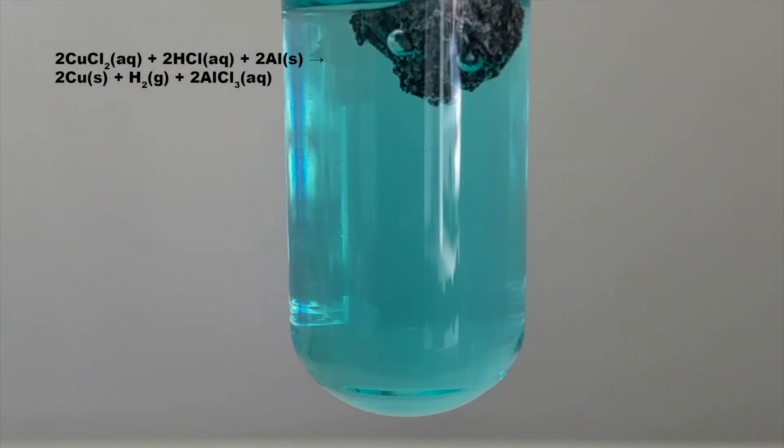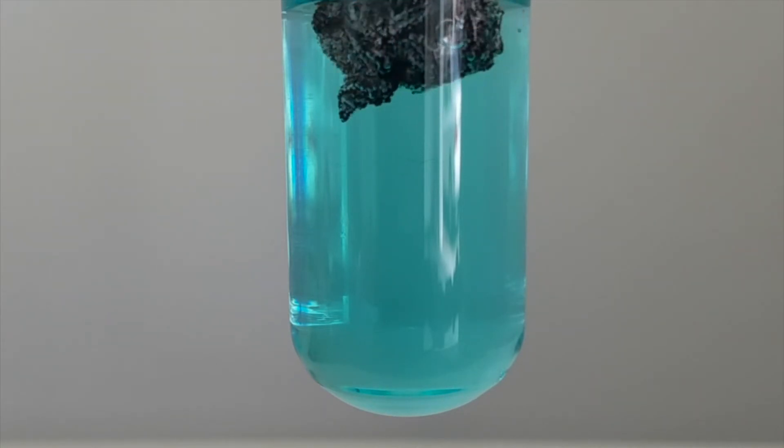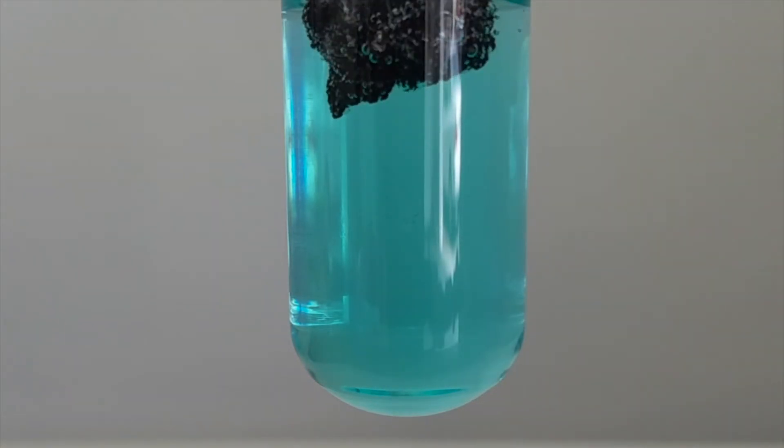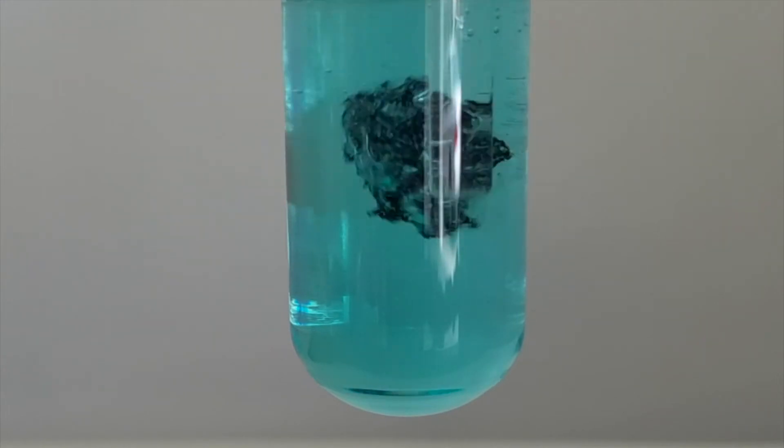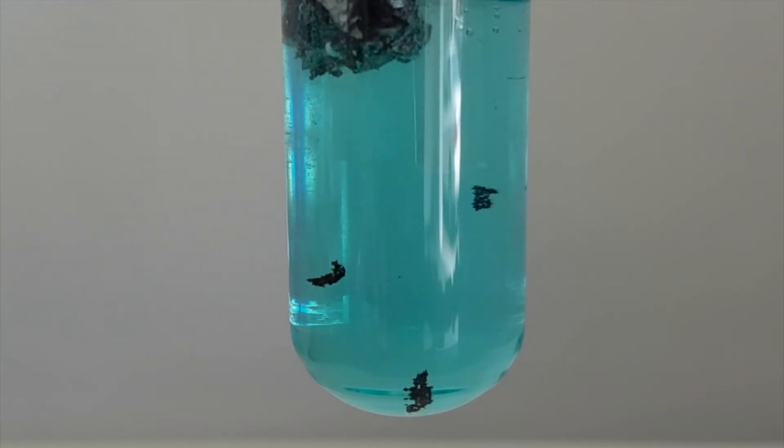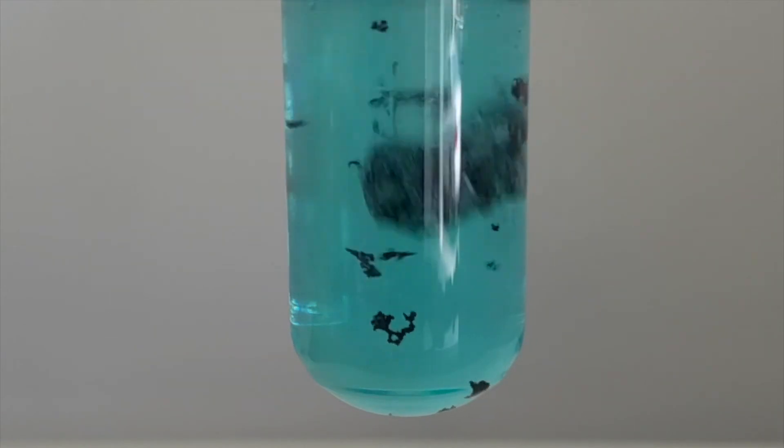Unfortunately, the glare from my window kind of disrupts the view of the reaction, but you can still see it pretty decently. When I poke it and move it around with a glass stir rod, chunks of the copper metal flake off of the aluminum and fall to the bottom. This ensures that there is definitely dissolved copper in the solution.